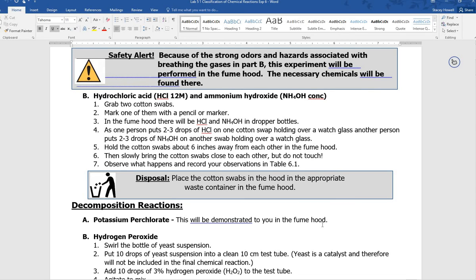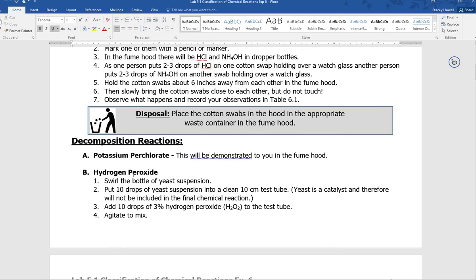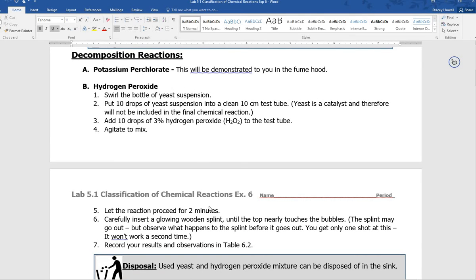Let me get there. Okay, so when it comes to the decomposition reaction, on the first one, potassium perchlorate, I'm going to demonstrate that in the fume hood right after I do that part A of the combination one. You get to do the hydrogen peroxide one, and I'll show you how to do the glowing splint thing with the potassium perchlorate one, so that when you do it, you're going to do it in the back. I'm going to have a candle that's lit that you can light your wooden splints with in the back, that you can then blow out and put them in.